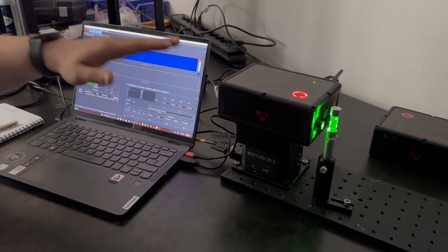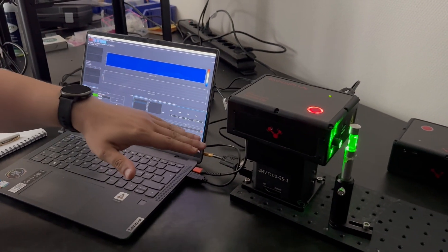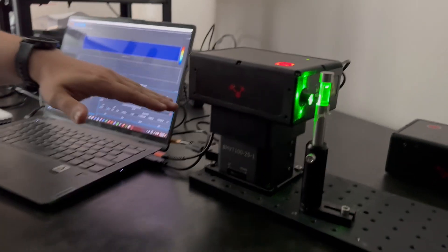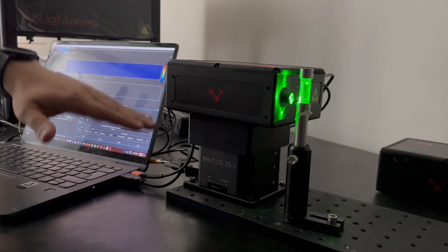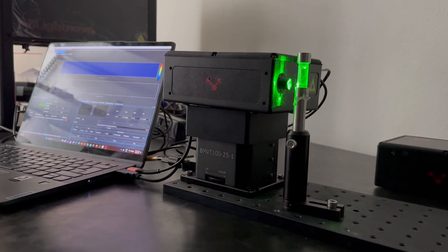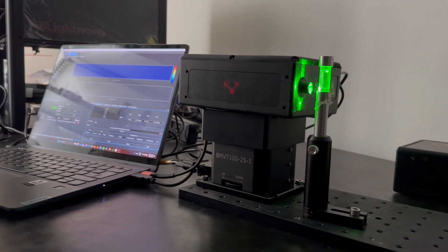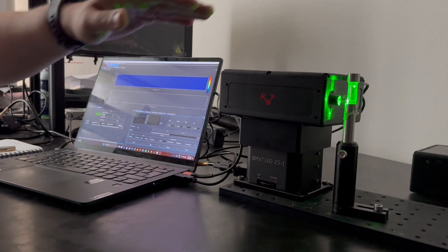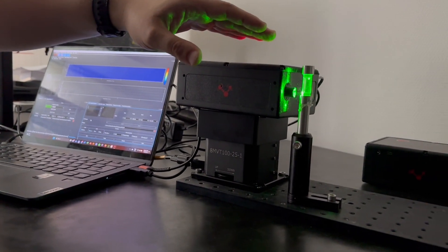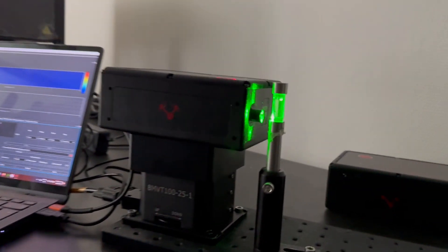The spectrometer is placed on a motorized stage moving in the Z direction and then we can perform a scan of an object, for example a cuvette with a sample.